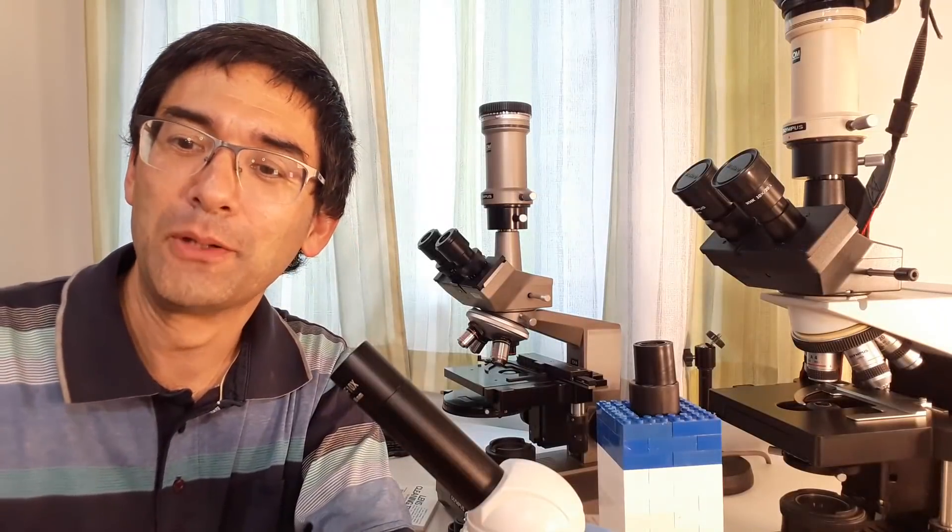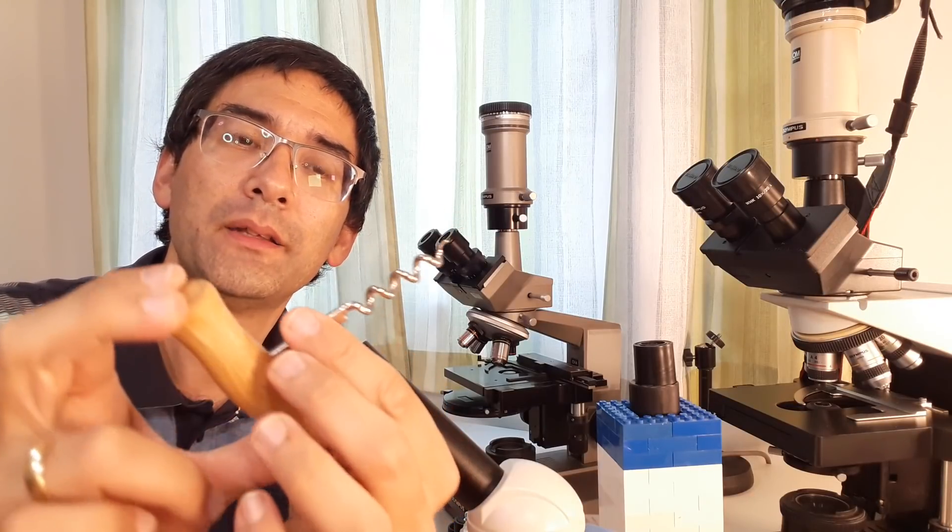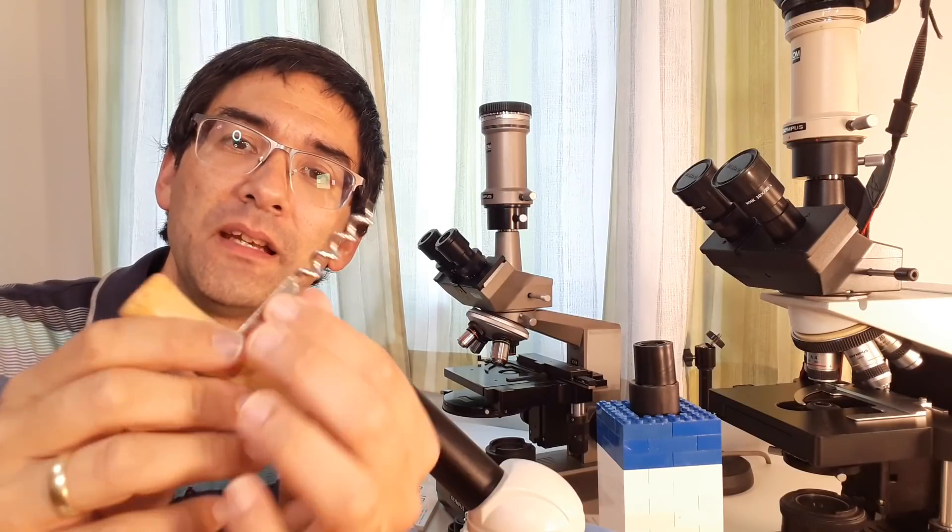Well, those spirilla, they actually look a little bit like a corkscrew bottle opener like this. And they move forward by turning and this is basically how they move forward in water.